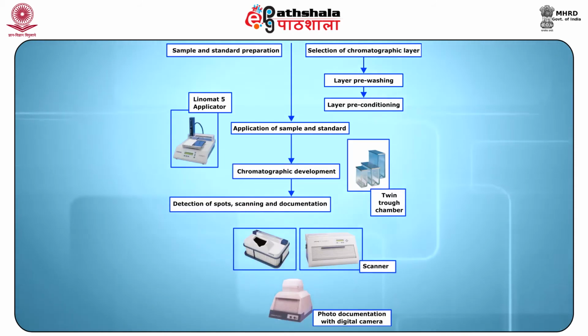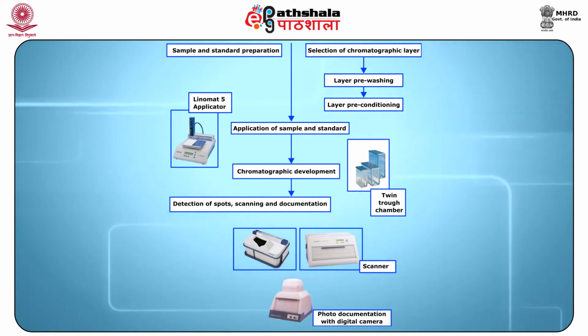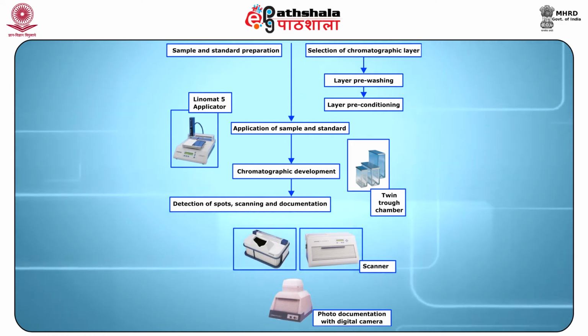The plates are moved by a motorized transmission system at a consistent feeding rate of 10 centimeters per second to ensure a homogeneous layer.